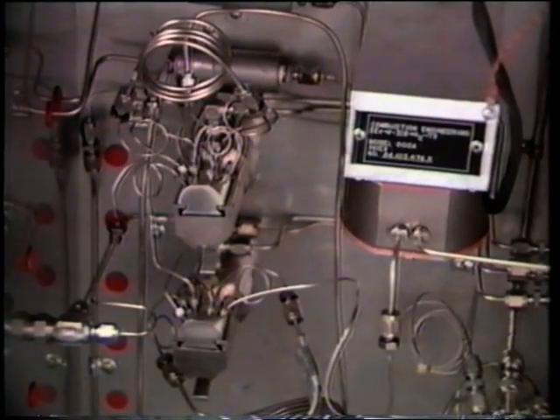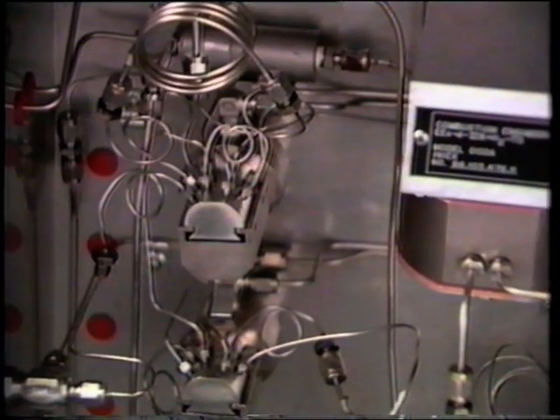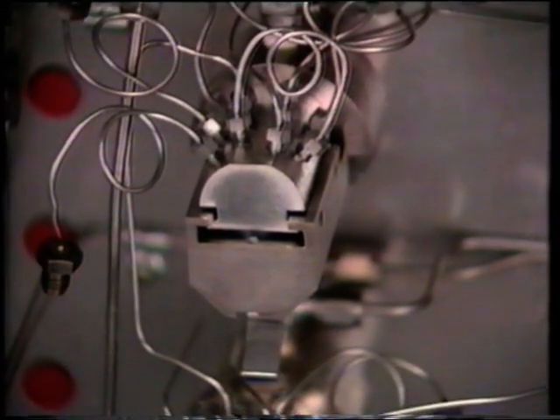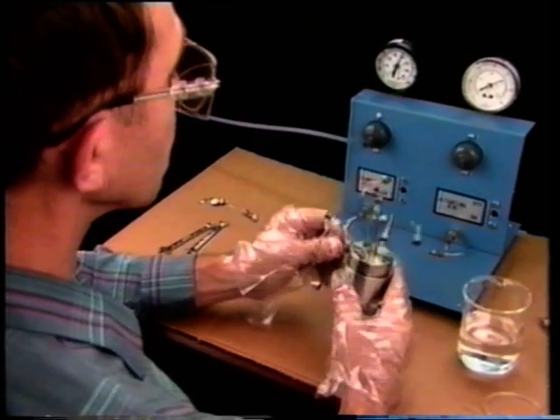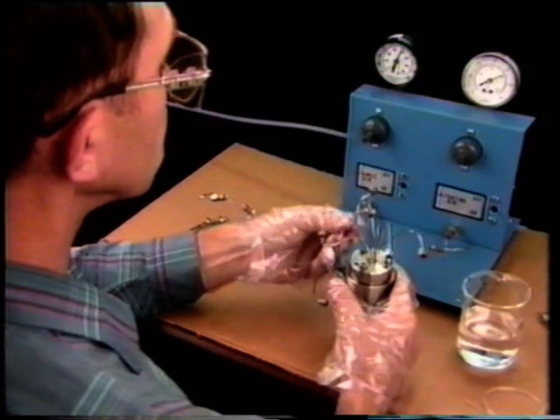Under normal operating conditions, a sample injection valve may reliably perform 500,000 cycles. However, the operating life of a valve will be dramatically reduced if it's exposed to harsh treatment or contamination. Common valve problems include ruptured sealing discs, slow or erratic switching, valve leakage, and plugged valves. If your inspection indicates that the valve is plugged, it can be cleaned without disassembly.